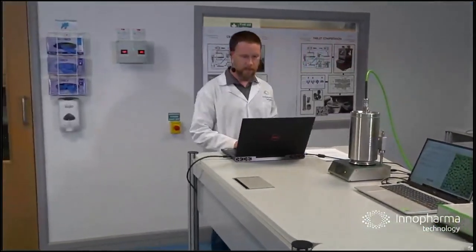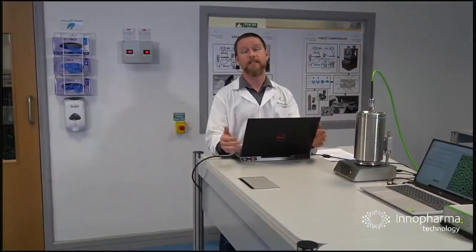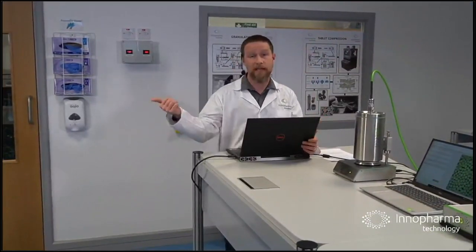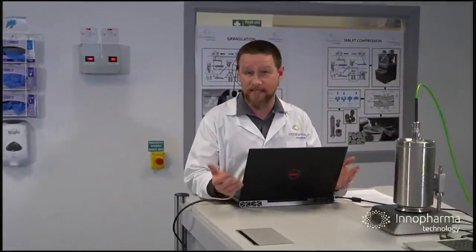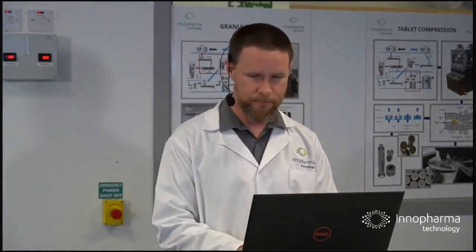So we're going to jump back in now and do some analysis. I'm going to take some data from our icon, from the inline icon, and we're going to take some data from sieve analysis. We're going to pull them into an Excel sheet and show what kind of correlations we can do. So hence this section was called Deep Dive by Excel, but I hope you stay with me for this and you get something from it. Okay, so let me just go back to sharing my screen.